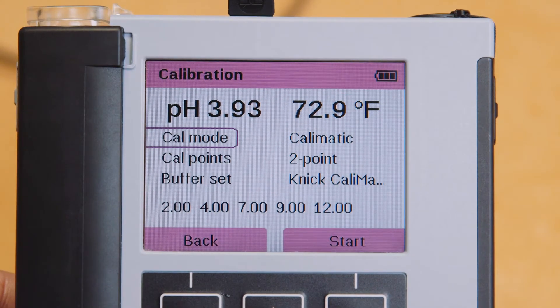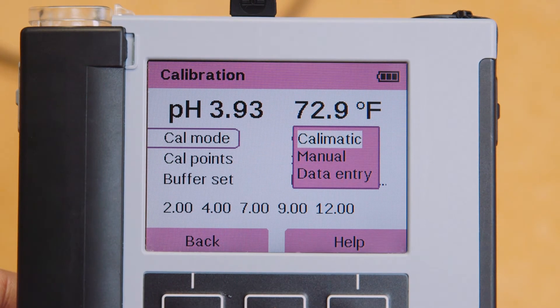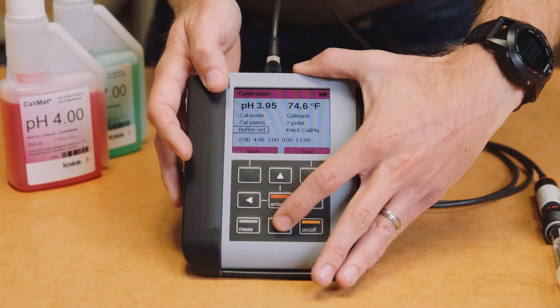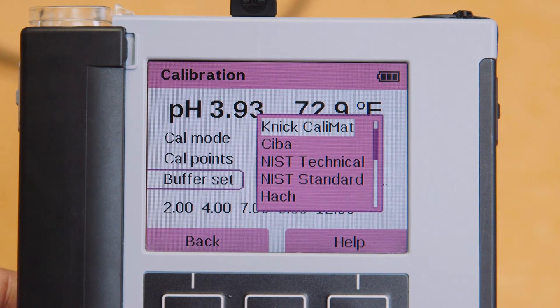There are three options for the Cal mode. We recommend Calmatic, or Automatic Calibration, with at least two points of calibration. In Calmatic mode, buffer solutions are automatically recognized and compensated based on the temperature reading from the integrated temperature detector. Once you've selected Calmatic under the calibration mode, it offers the ability to select which buffer set you are using. The Portavo is pre-set with ten common buffer sets to choose from, all pre-programmed with temperature compensation tables.